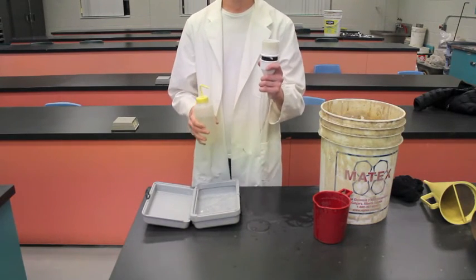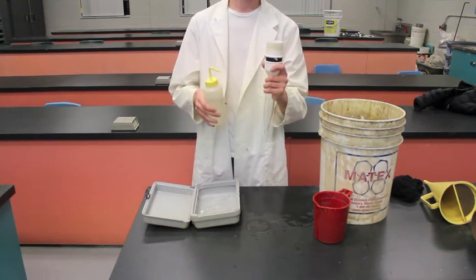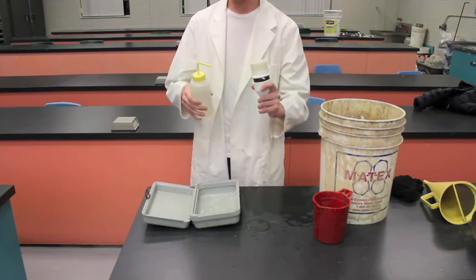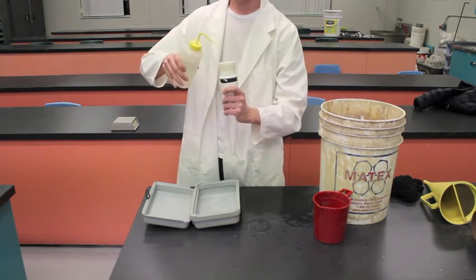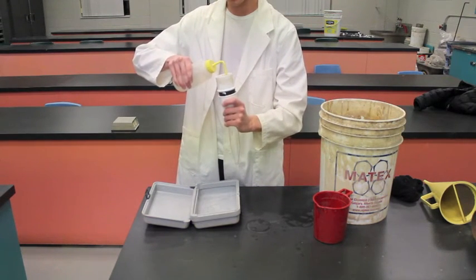And remember that your desirable limits you want just under 2% by volume or under 2% by volume is what we're hoping for, what we're looking for in our drilling fluid.